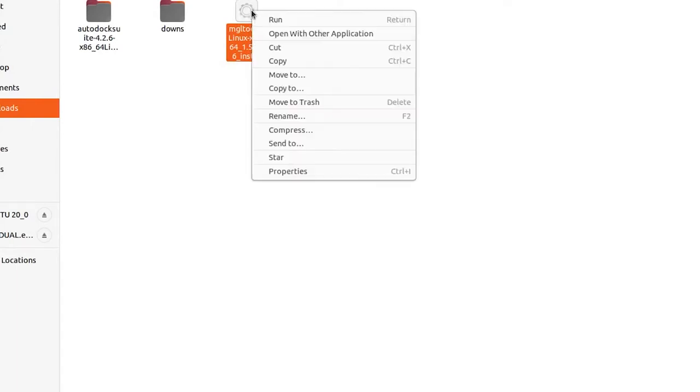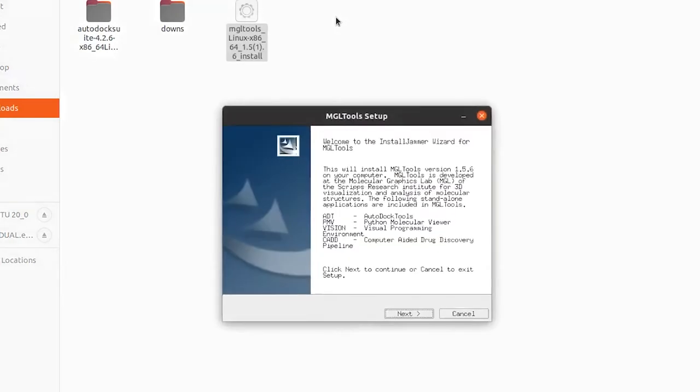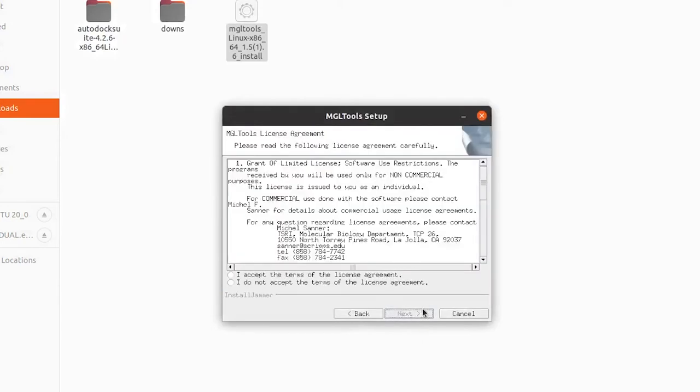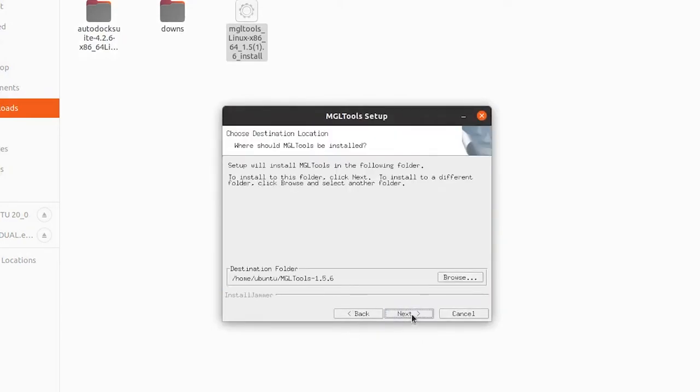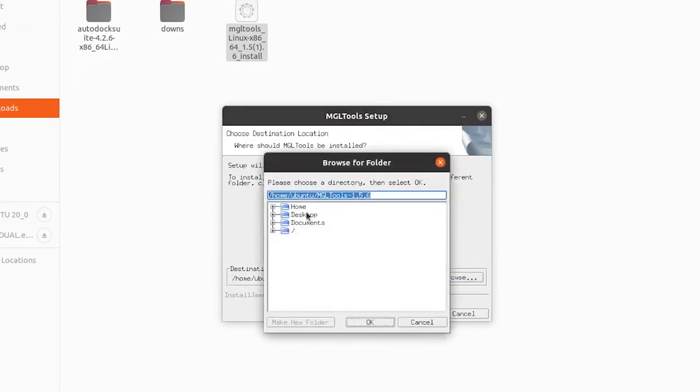Now right click on the file and click run. The MGL Tool setup will open. From here it is easy to install. If you want you can change the location of the installation or leave it as default option.